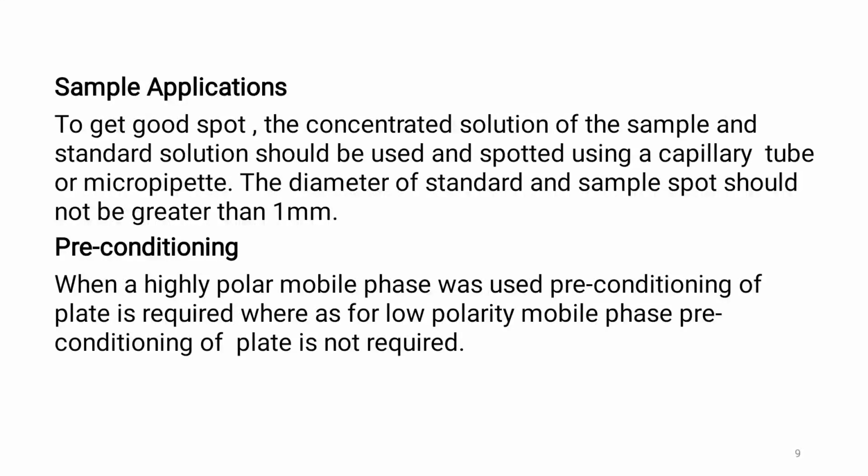Next is the preconditioning. Preconditioning of the HPTLC chamber is required for efficient separation. It is the process in which the chamber is saturated with mobile phase components used for development. When a highly polar mobile phase is used, preconditioning of the plate is required, whereas for a low polarity mobile phase, preconditioning of the plate is not required.